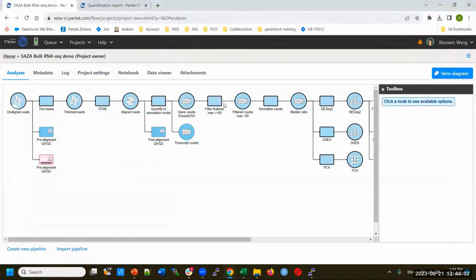When I first did that, I used less than 50 to filter. Another thing to check after you perform this analysis is to look at the mouse over. How many genes do I still have? Before I had 26,000, and now after this, I have 14,567 genes left. For most human data, if you focus on highly expressed genes, I think that's enough. If you have more than 10,000, I think that should be okay.